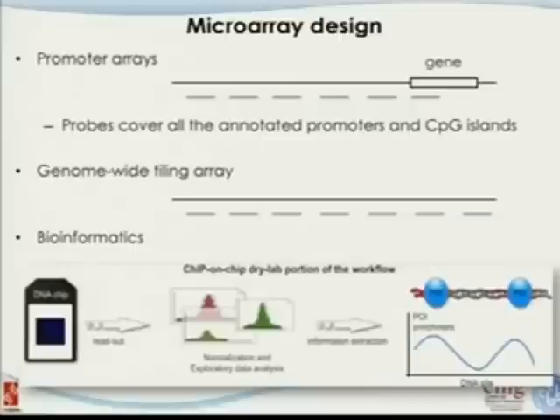For the bioinformatics part, you get the data from the chip, and then you figure out the signals, which part of the genome is up or down, the signals high and low, and then you try to infer which part of the genome the protein originally bound to. Okay? Any questions at this moment? No? Is everybody crystal clear, or just confused? I hope it's the clear part.